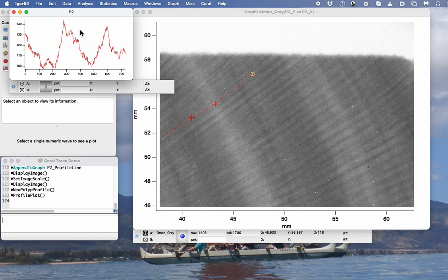If you're interested, there's a lot more things we do with this, but this is the basic function. It gives you the grayscale. In this case, it's looking along points along the line, I guess it is, but we can scale that to these millimeters when we get further into the program. I just wanted to show you the basic function, see if you're interested. That's it.